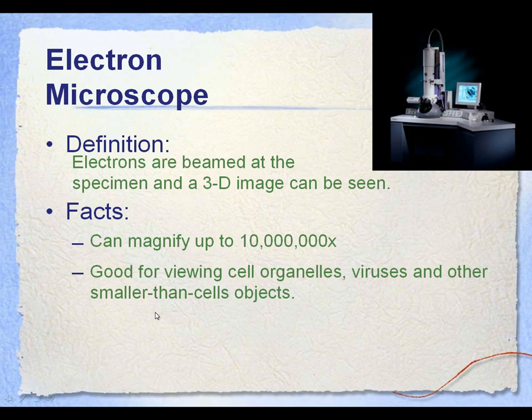There are 2 types, the scanning electron microscope and, I can't remember the other one off the top of my head. Either way, both of them do a similar thing.